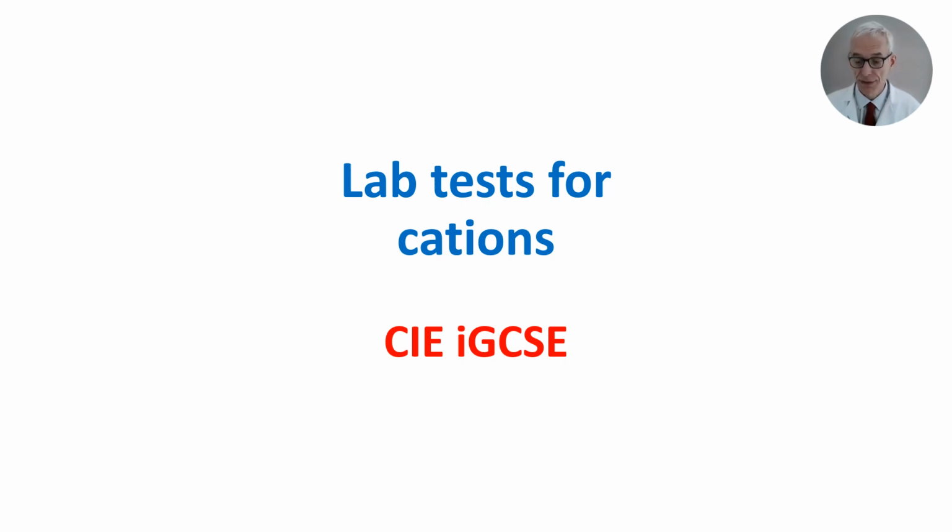Lab tests for cations. Please note this is for international GCSE only, CIE iGCSE only. There are significant differences with UK GCSE specifications.